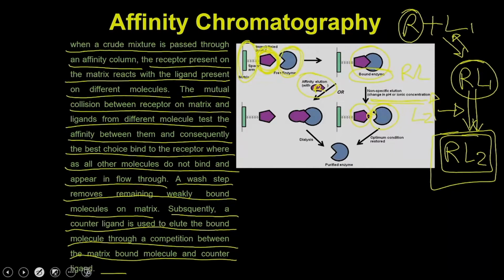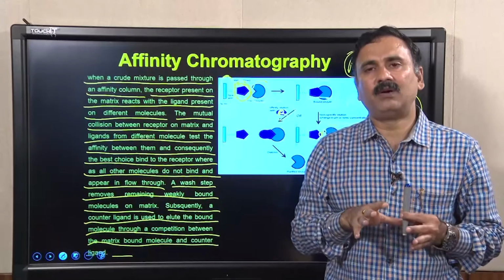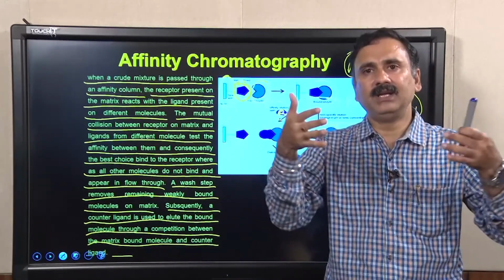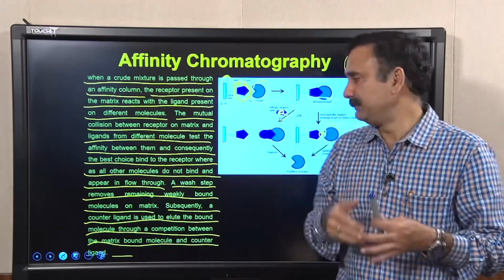So, this is the basic principle through which you can exploit the affinity phenomenon to purify different complexes, exploiting the receptor-ligand concept or the affinity concept.